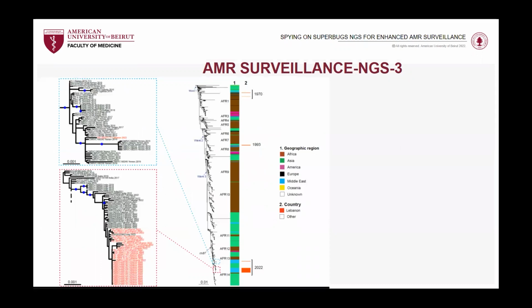After that came cholera, and in collaboration with Dr. Matar, we were testing for the whole country at the start. Cholera outbreak started in Lebanon on October 3rd, 2022. That's when we received the first sample. And one very good thing came out of using NGS was a very quick response, because we could track the strains of Vibrio cholera that was circulating in the country in food, in water, in sewage, and in humans in a very efficient manner.